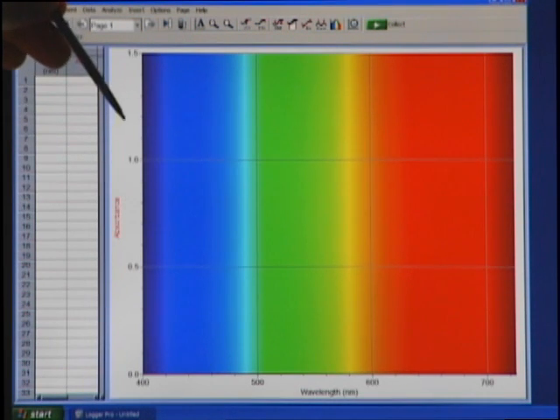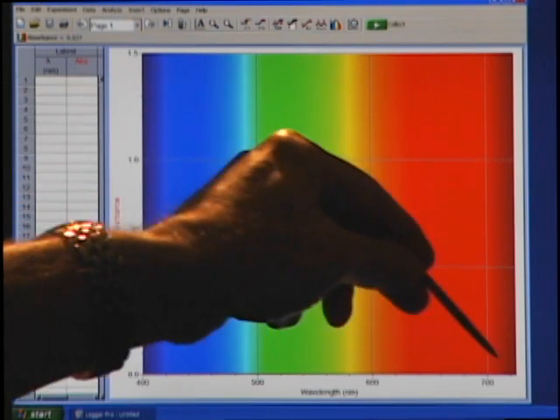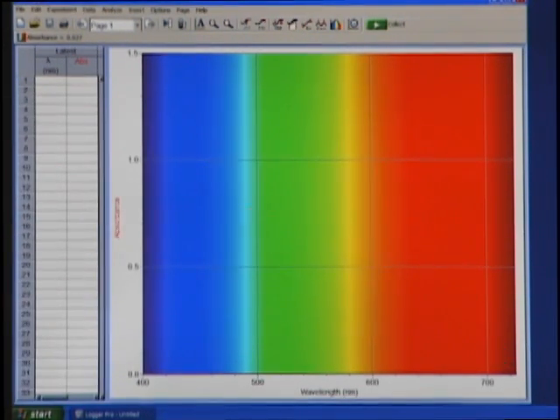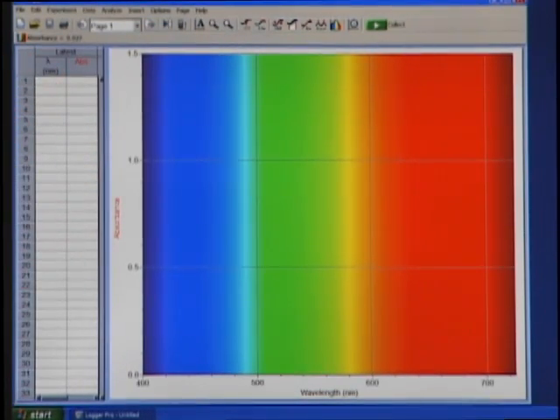I should have an indication on the screen up in the far left of the toolbar. We can see absorbance is displayed, so it's been auto detected. We can see a full spectrum displayed on the graph from a wavelength of 400 nanometers all the way up to 725 nanometers. That's the range of the SpectroViz, and we're ready to go.